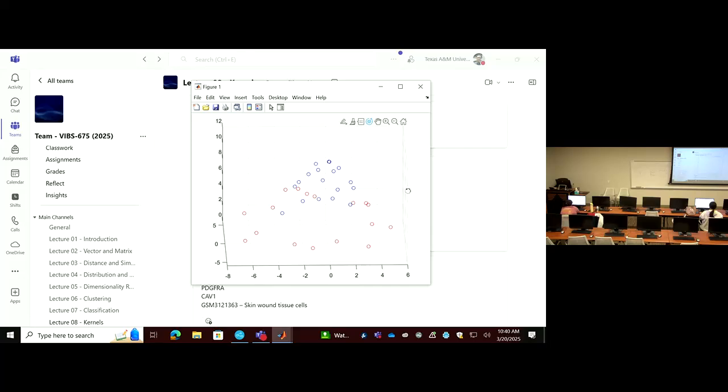Right, left click, and then click left again. Oh, it's already finished, so you have to start another session. Close it, yeah. Just paste all country. You have to copy that again.